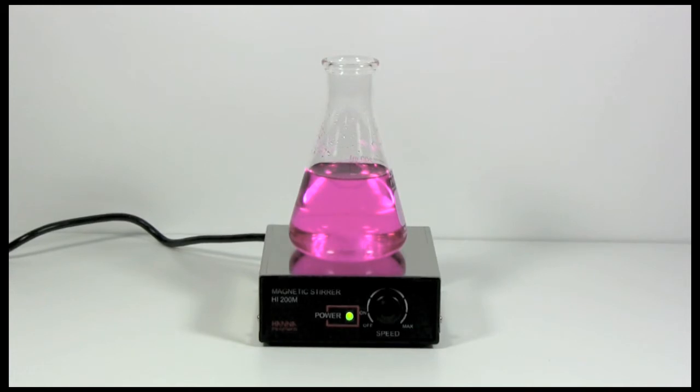This is our median line magnetic stirrer with a stainless steel base. It's called the 200M from Hanna Instruments.